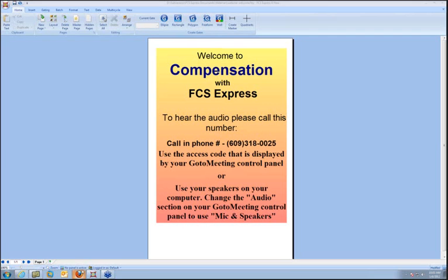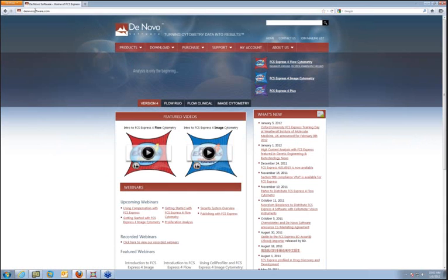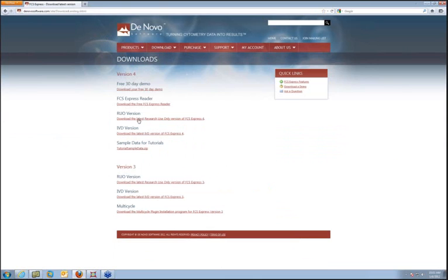Just as a quick note, how do you get that upgrade? You go to our website at www.denovosoftware.com and you can go to downloads, and you can download the latest RUO or IVD version depending on what you're using.